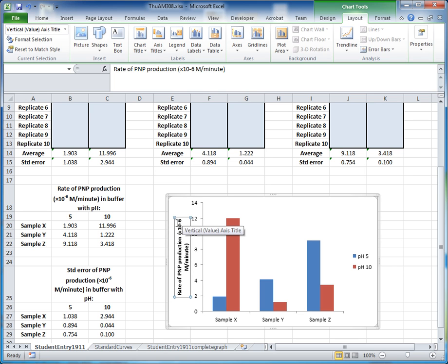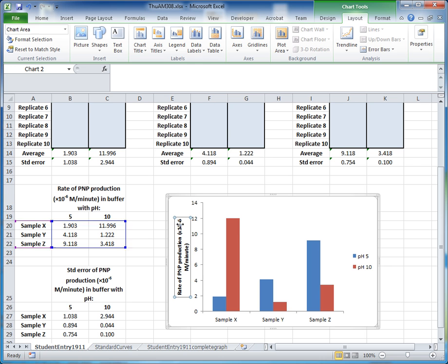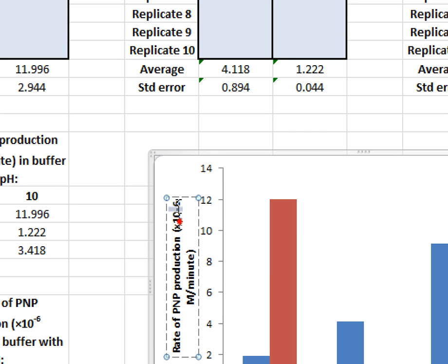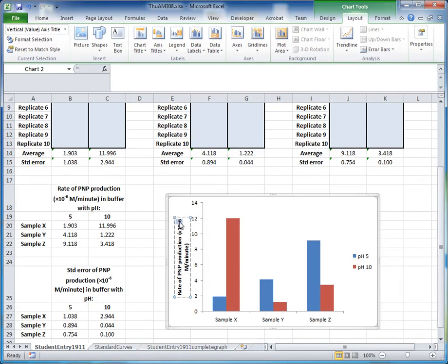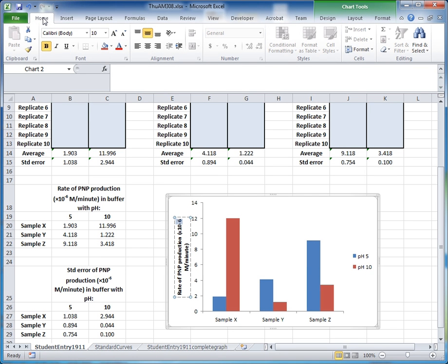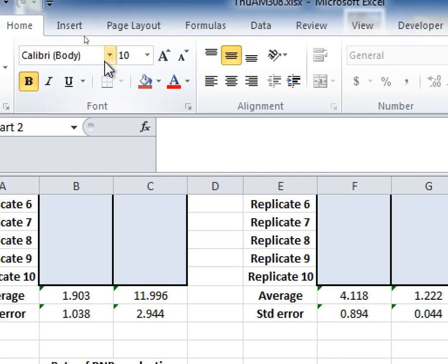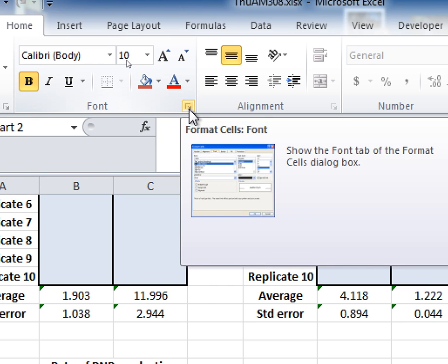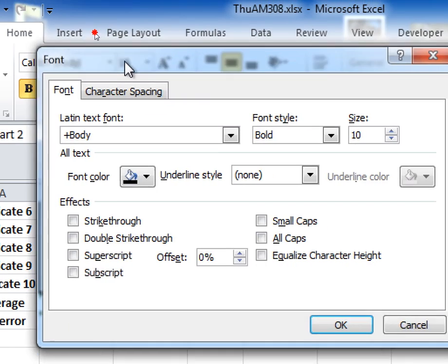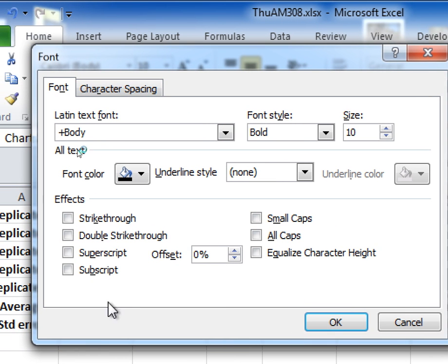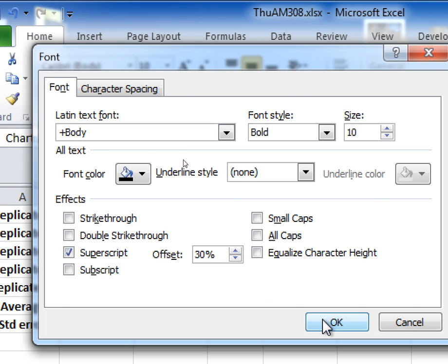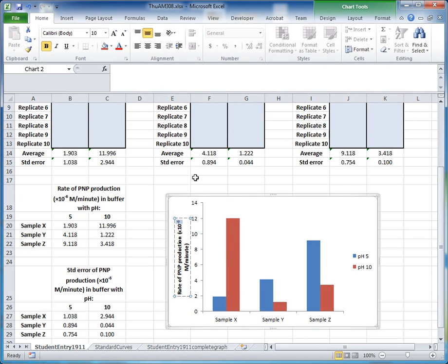You'll notice the '-6' is not yet in superscript. To fix that, highlight the '-6' in the axis title, then go to the Home tab and find the superscript button in the Font area. This opens a font dialog box — tick the Superscript option and click OK. Zooming out, you can see the '-6' is now correctly in superscript.